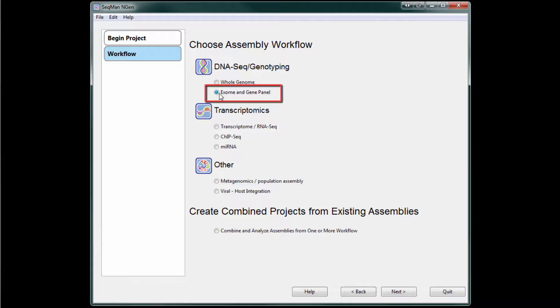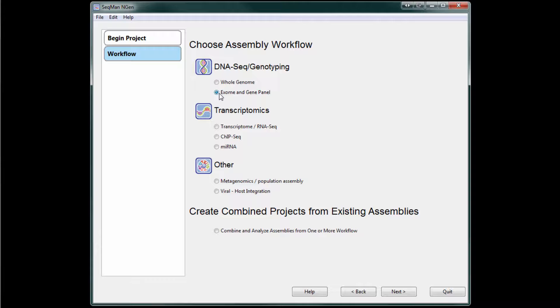In this example, we'll be looking at Illumina whole exome sequencing data for a trio of human samples from the CEPH pedigree.